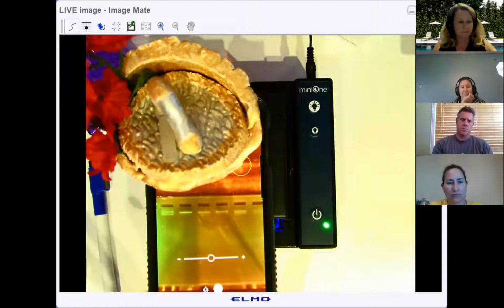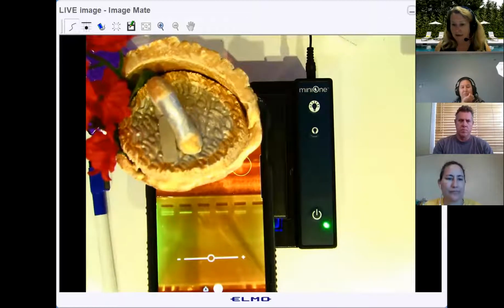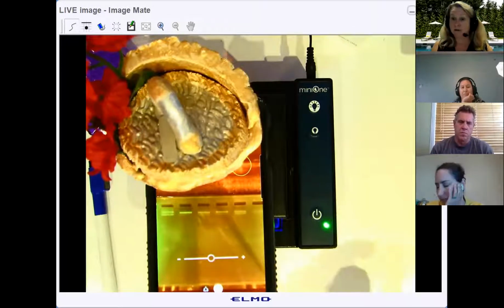I have them put their cell phones up at the end and everybody takes a picture of their gel to take home, and I can assign the analysis for homework if I want, because they don't have to wait until the next day to see if their gel worked or not. And the other nice thing is, if the kids screw up, they're going to notice it right away.